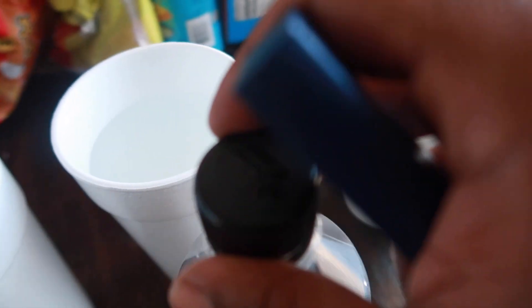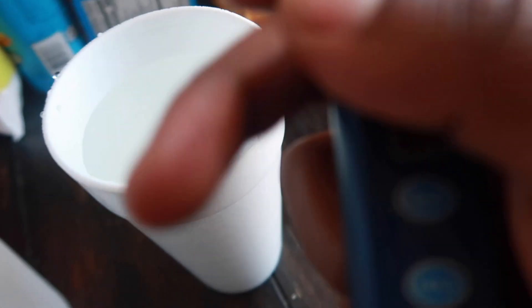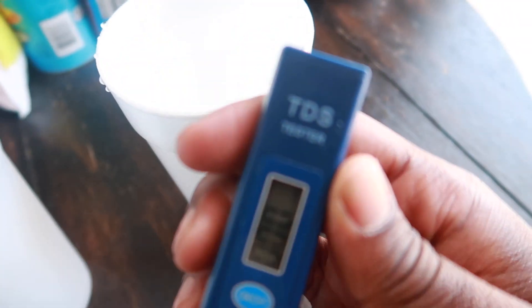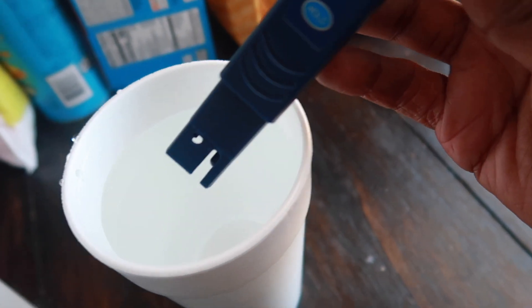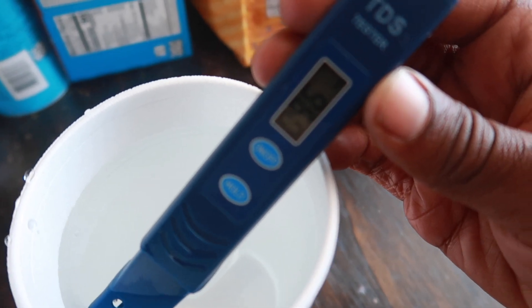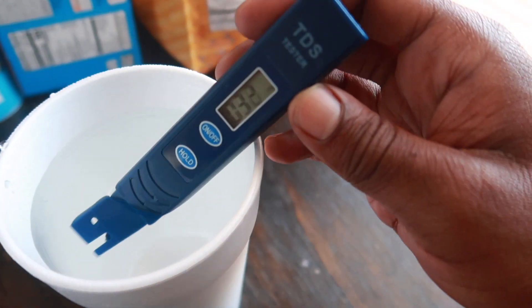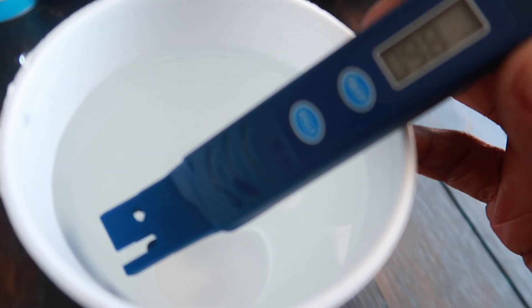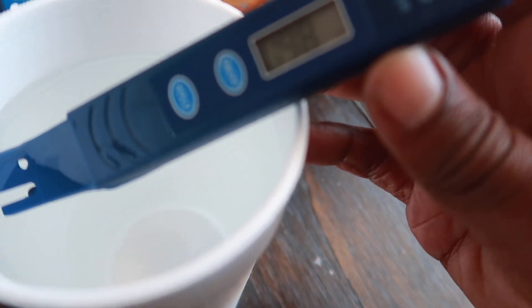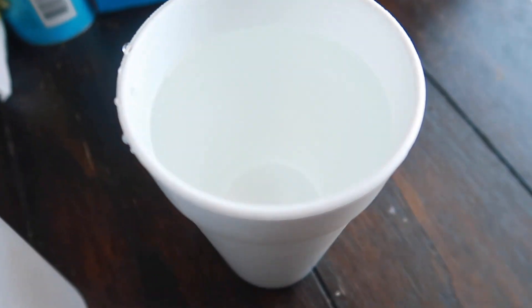We're going to start out with the water from the faucet — the Flint water, the Michigan water, the Detroit pipe water — and see exactly what the TDS level is. We cut it on, drop it right in the water, and we're getting a reading of 96, 97, 98 ppm total dissolved solids. It's not as bad as some other water readings I was seeing on YouTube, but let's call it 98.